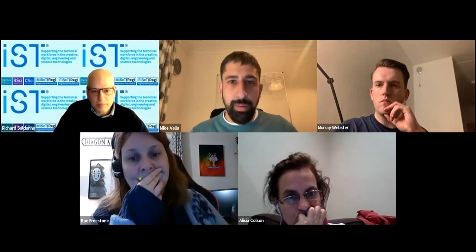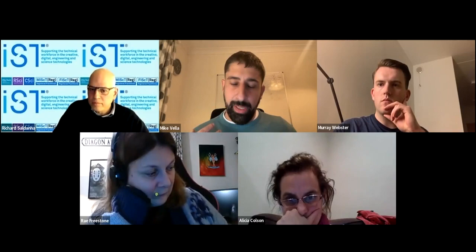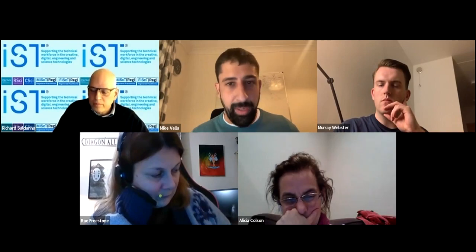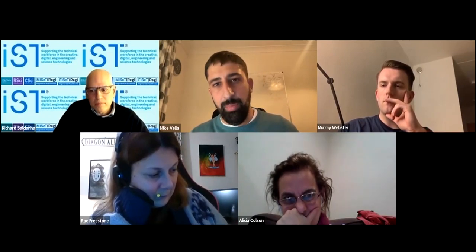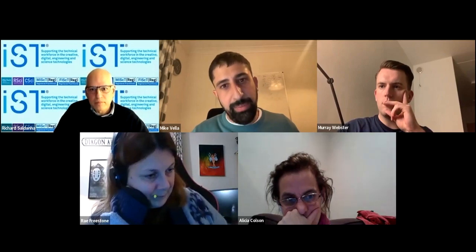We do work very hard to compensate against that. Firstly, by making our models as small as possible, thus reducing their ability to overfit. And secondly, by training on a very wide range of and very balanced data sets. Having said that, it's always a concern, and it's one of the things that my group in particular works the hardest to avoid. But at a practical level, we're very confident that this isn't a problem. At a theoretical level, it certainly exists as a possibility.